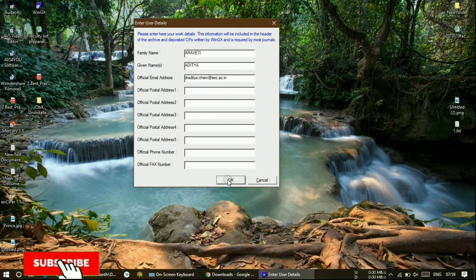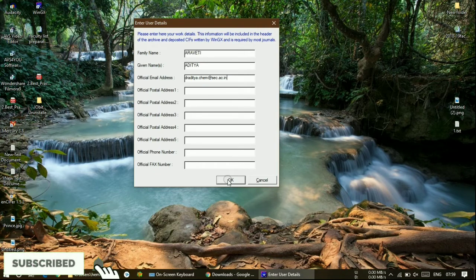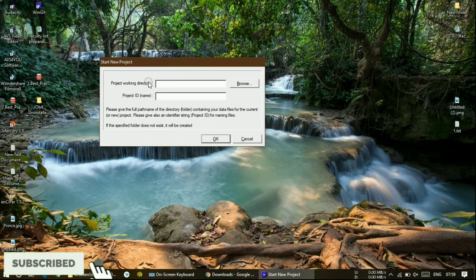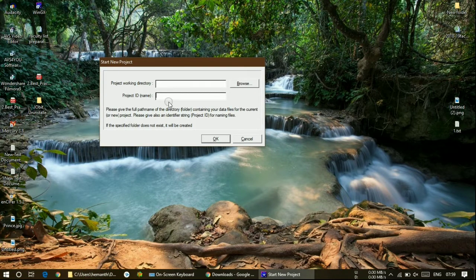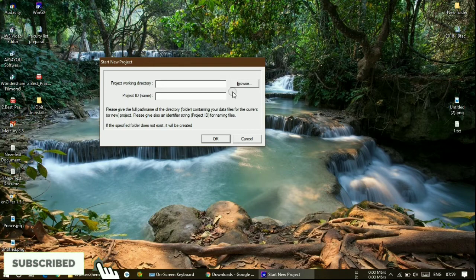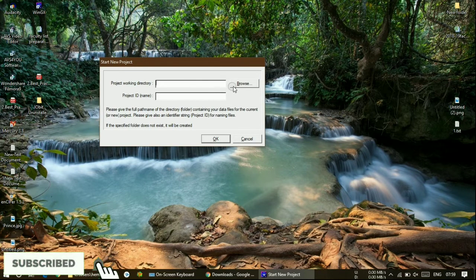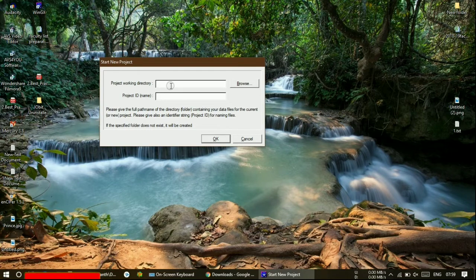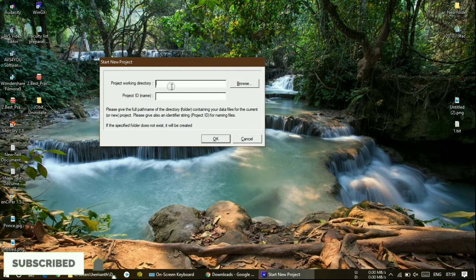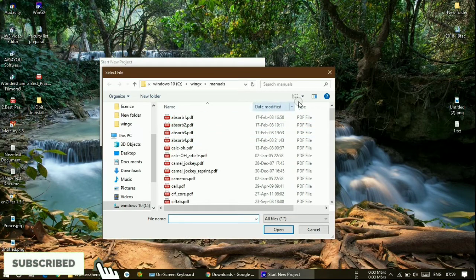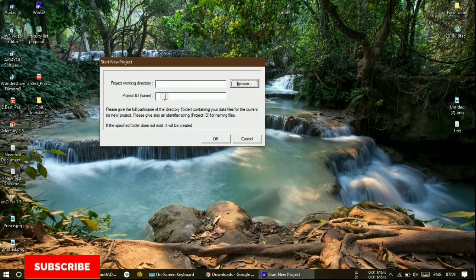Now it is being opened. The project work directory, project ID — everything will get opened here. What we need to open is: you need to browse a .ins file. Only .ins files are opened here. Just go to the browser and click to go to the crystal data and select the .ins file. INS means instruction file — this data you will be getting from the crystal XRD data.